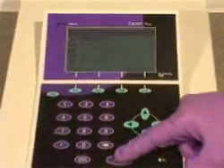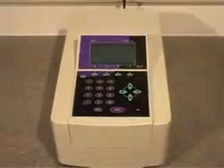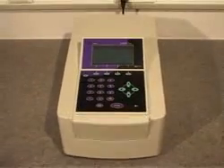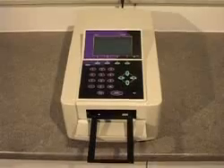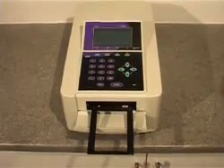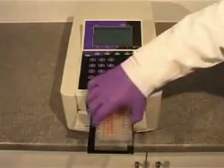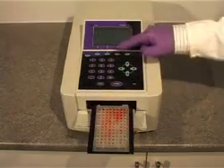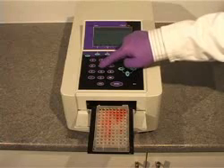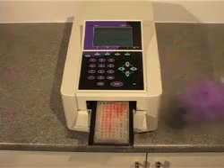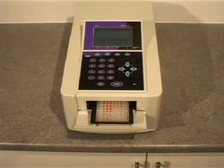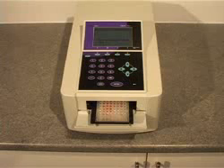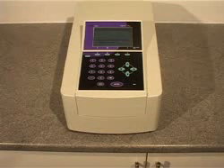Running a stored method is simple. Select the required method, enter a numeric plate ID, place the plate in position, and press run. The plate is moved into the instrument and read in less than 10 seconds.